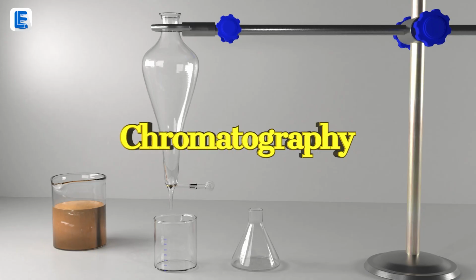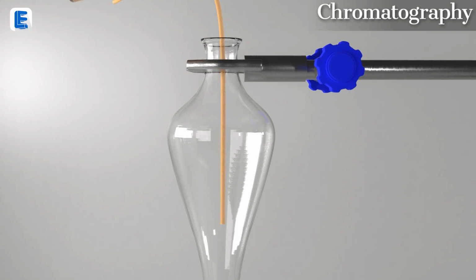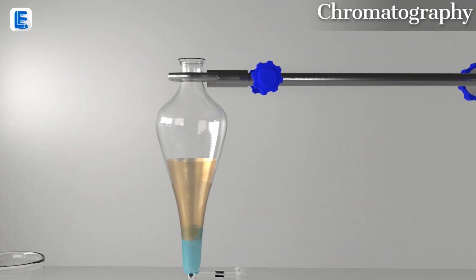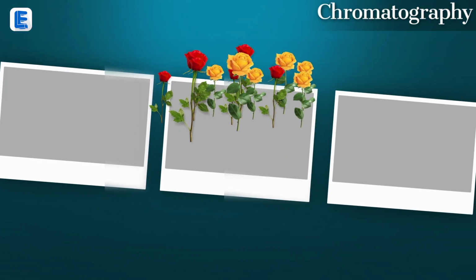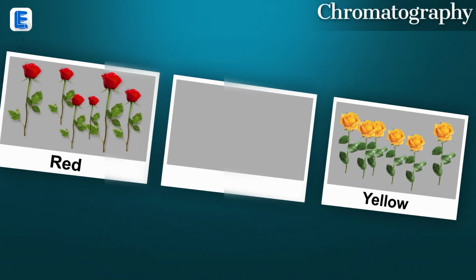Chromatography. Chromatography is an important method used for separating mixture substances, purifying compounds, and testing the purity of substances. Initially, this method was used to separate colored substances obtained from plants.